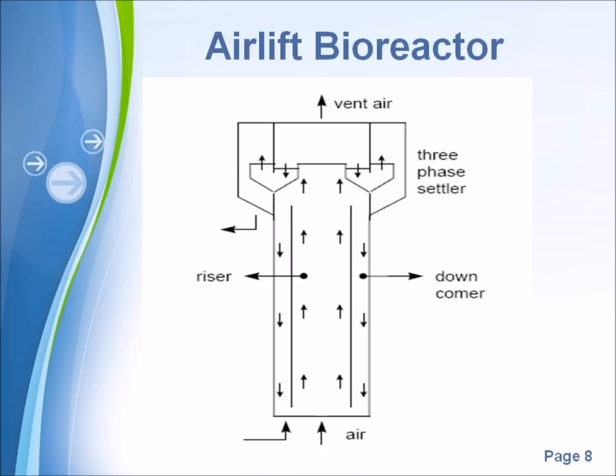It is a uniform cylindrical cross-type and has an internal loop or external loop riser configuration. The external loop riser configuration is adjustable, and the change in the configuration improves the oxygen transfer rate via the mass transfer coefficient for a particular rate of airflow. This helps to provide the required dissolved oxygen concentration for a specific microbial system.